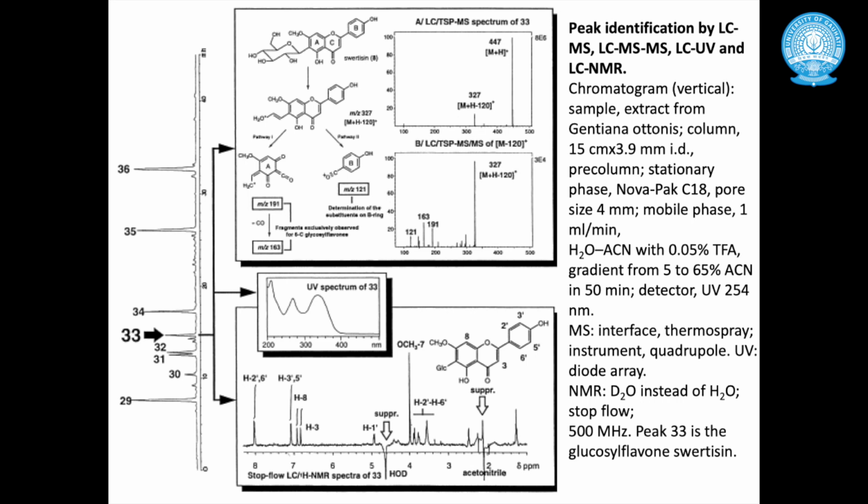Then LC can also be combined with NMR. All these identification and separation techniques sometimes work independently, or sometimes we can use them in combination to get faster and more authentic information.